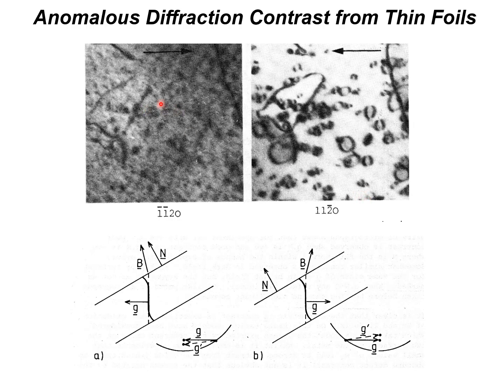And that affects the ability to determine whether the loops are vacancy or interstitial, because to determine that, you want to know what the image is in one diffracting vector, in one direction, and compare it with the image in another, to see if one's inside and one's outside.